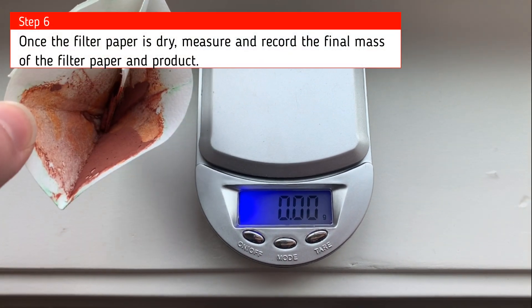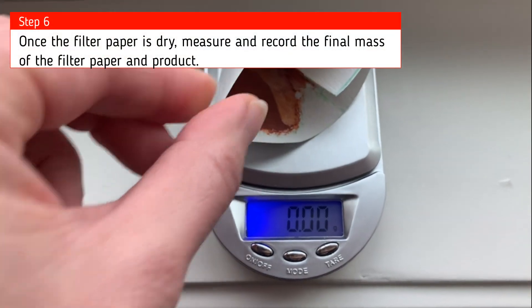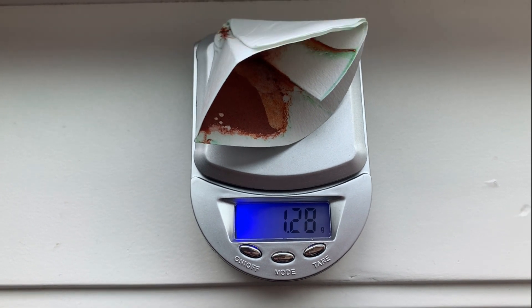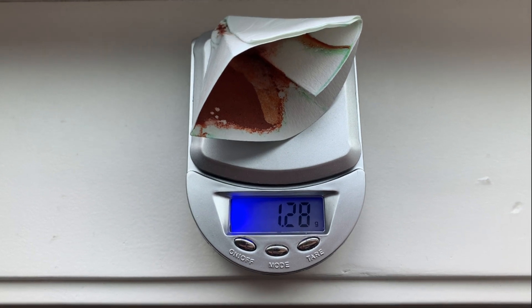Now that the filter paper is all dry, we will put it on our balance and record the mass of that filter paper with the copper. And that is how we start with copper and end with copper.